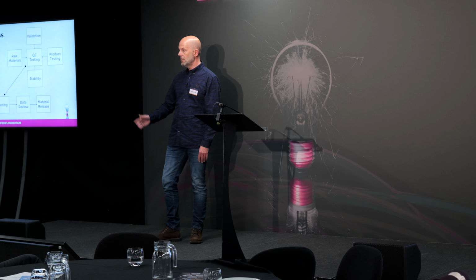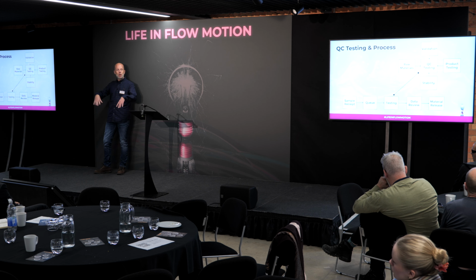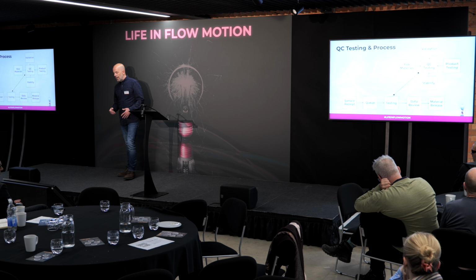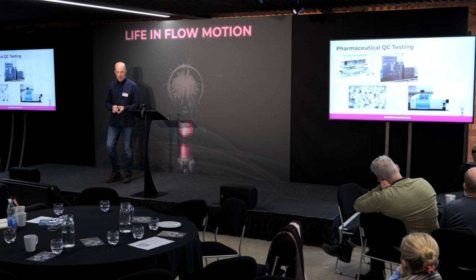So QC has lots of competing customers. You have one lab, maybe multiple teams, but there's a lot of work going in there, lots of competing customers wanting validation samples, wanting their products tested, the raw materials, different manufacturing leads. So just an introduction, an overview of what some pharmaceutical testing looks like.